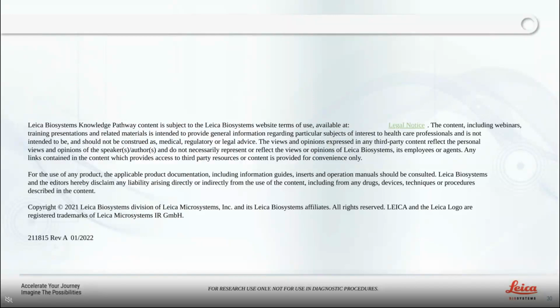Cryosectioning a tissue that has not been fixed previously reduces steps in your staining protocol, as an antigen retrieval process is not necessary. And antigen retrieval is an approach used to reduce or eliminate chemical modifications due to fixation.